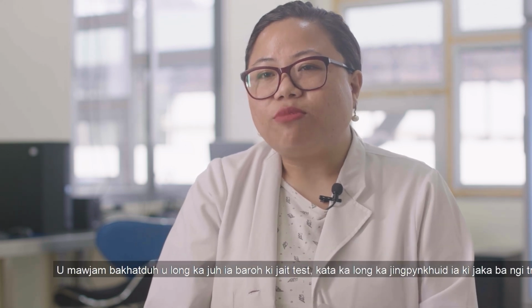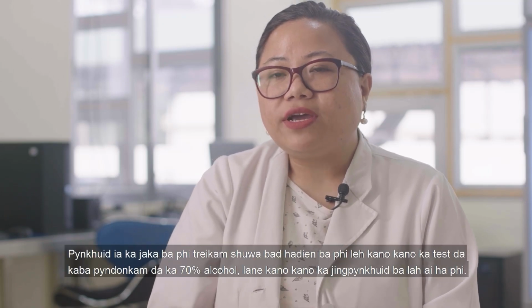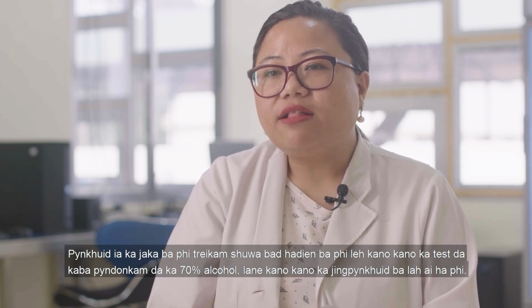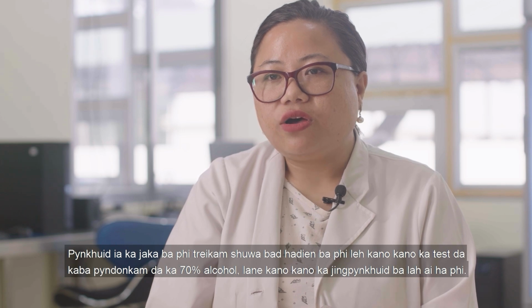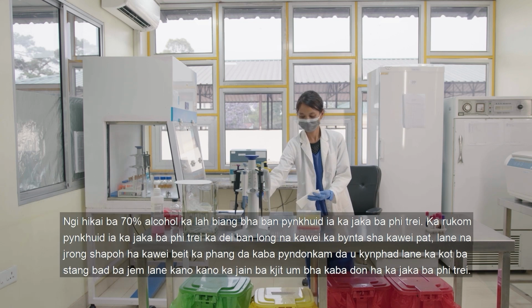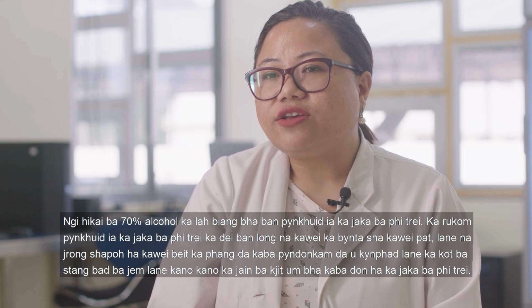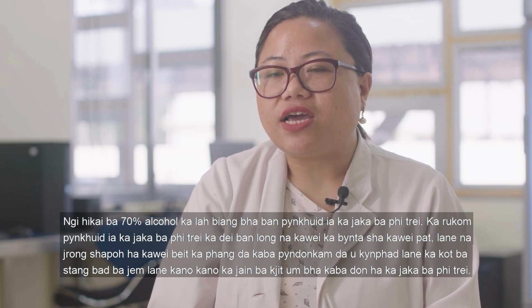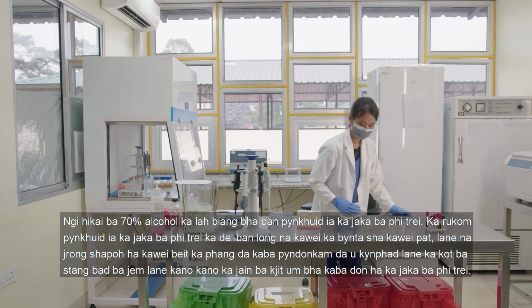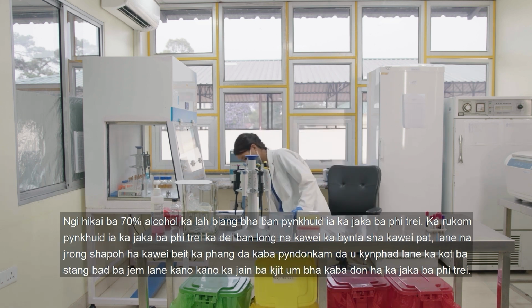The last step that is common to all testing procedures is the cleaning of your working surface area. Clean your working surface area before conducting any tests and after conducting any tests with the help of 70% alcohol or any kind of disinfectant that is provided to you. We advise that 70% alcohol is enough to clean your working surface area. The direction of cleaning your surface area should be either from one side to the other side or from top to bottom in a unidirectional pattern, using either a cotton swab or a tissue paper or any kind of absorbent material that is available in your facility.